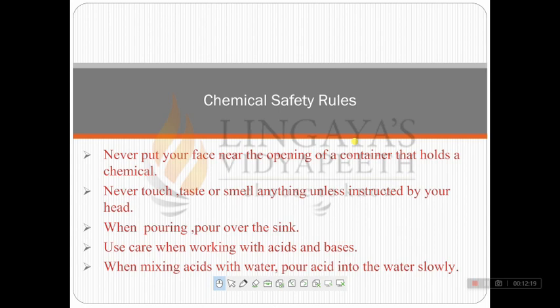Never touch, taste, or smell anything unless instructed by your head. While working in the laboratory, the instruction of the head is very important. One must always bear in mind the instructions given by the head of the laboratory. So you should never touch, taste, or smell anything unless it is instructed by your head.